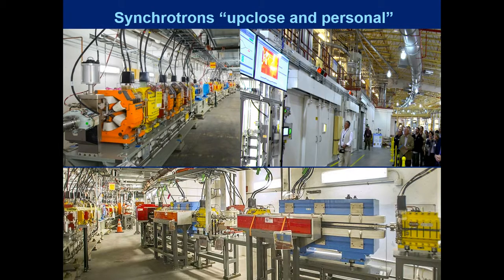So this is what synchrotrons actually look like. In the upper left corner, these are the magnets that help accelerate and propel the electrons. The white part here is the actual magnet. Some of these you'll have 6 magnets in a circle, some have 5, some have 4, and it all depends upon what's happening with the movement of the electrons. They generally move through this lead tube through these magnets, and these help to move it along.